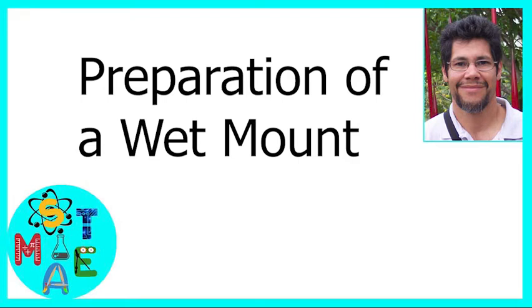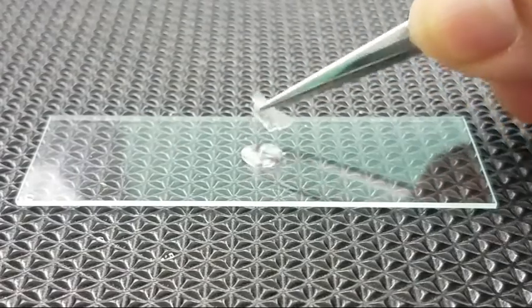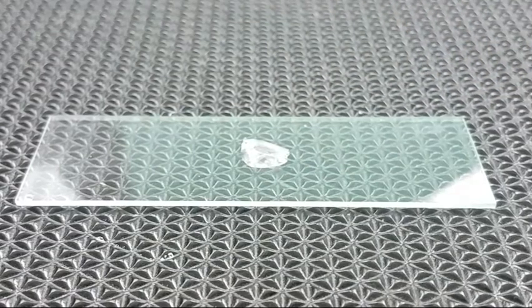Today's episode, preparation of a wet mount. Place a drop of water in the center of a clean slide. Break a piece of onion and peel a thin layer of the inside of the onion tissue. Using scissors, cut a small piece of the peeled tissue layer the size of a pencil eraser tip and place it in the drop of water.